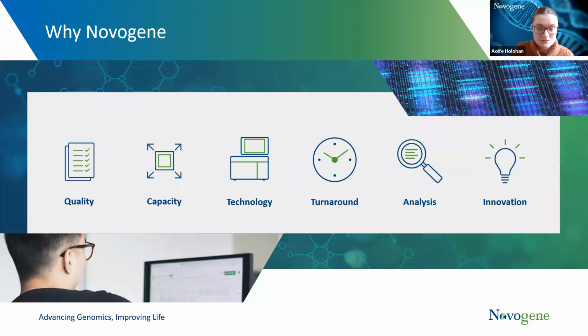With this new addition, we're now able to offer our fastest ever turnaround time for RNA and whole genome sequencing, just 10 working days from sample arrival to data release. Falcon 2 really highlights the innovation that we strive for here at Novogene in an effort to keep pushing the frontiers of genomic research. NovoMagic is another example of this innovation and an example of how we endeavour to provide solutions based on our customers' needs and to continuously introduce new and helpful tools to the genomic industry.